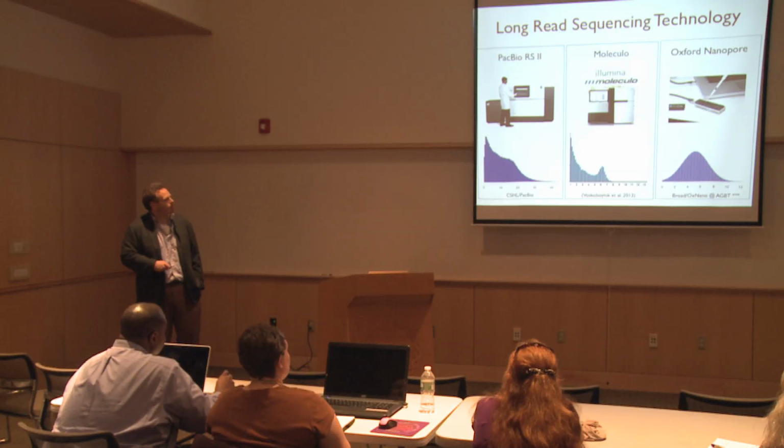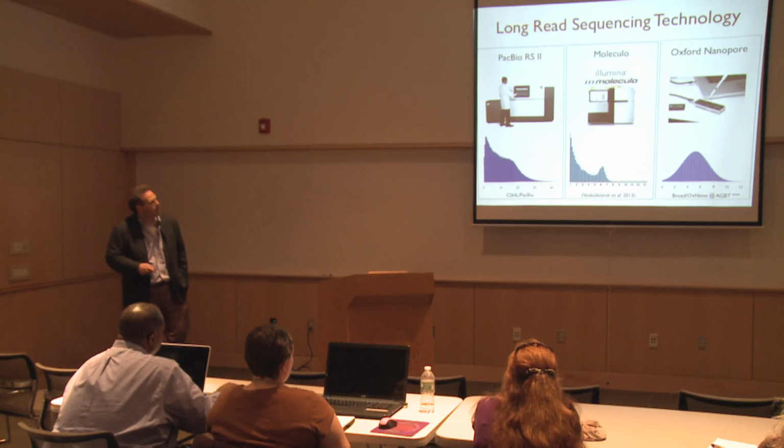The people are reporting relatively nice read lengths on the order of a few KB. So this is my visual recollection of what was presented at this meeting in February. You get a nice couple KB reads out of this. The challenge, what people are starting to report, is very high error rate. So just yesterday there was a report of a 30% error rate from these data.